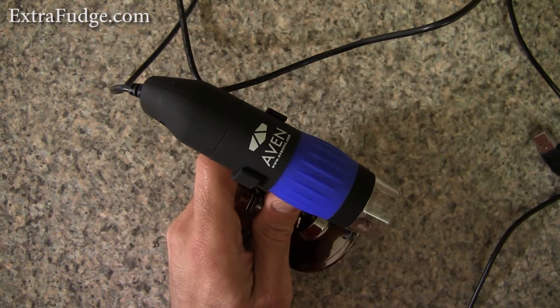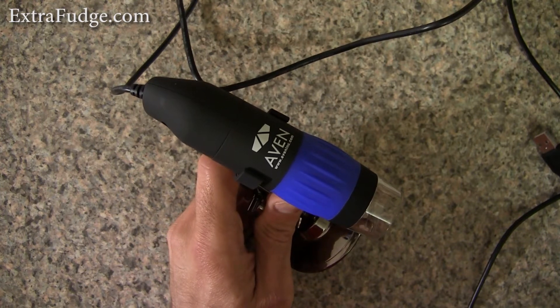Hi everybody, today I'm going to talk about Zipscope by Aven. This is a proclaimed professional digital microscope that connects to your computer through the USB port.